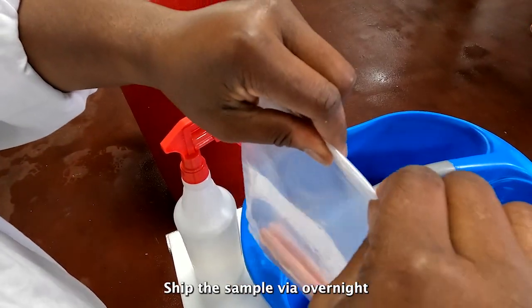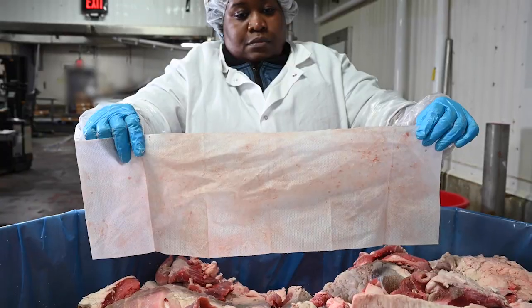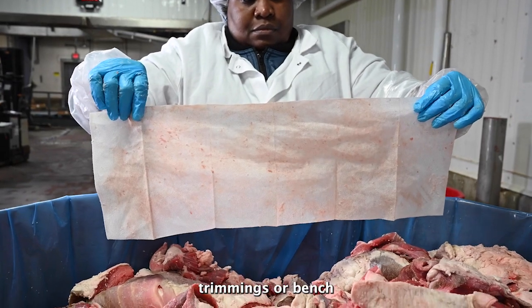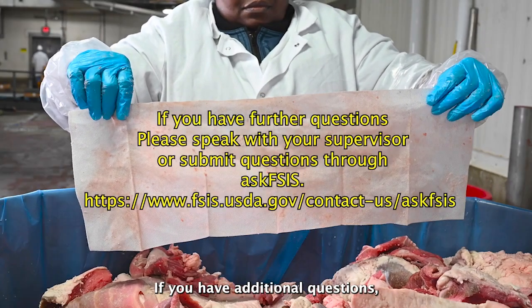Ship the sample via overnight courier. This completes our cloth sampling of raw beef manufacturing trimmings or bench trim products from a combo bin or boxes. If you have additional questions, please discuss them with your supervisor or submit questions through Ask FSIS.